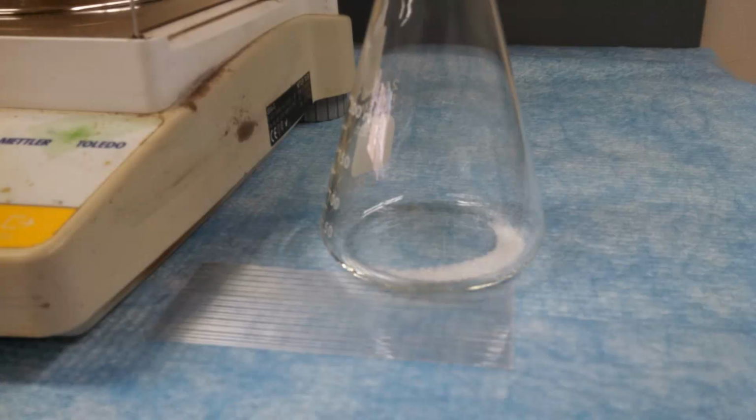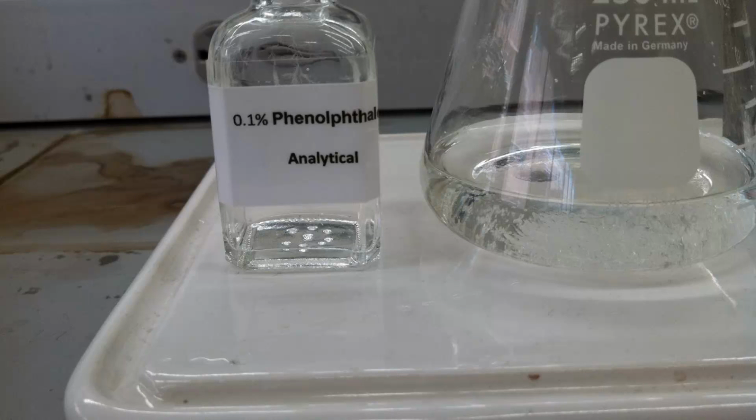Either way. Once you have your KHP in your Erlenmeyer flask, you're going to add about 100 milliliters of water and swirl to dissolve. This takes a long time. Be patient. KHP just doesn't dissolve very quickly, but it will all go into 100 milliliters of water. You're then going to add about 2 or 3 drops of phenolphthalein indicator to the flask and swirl to mix that around. The phenolphthalein is going to be in these little dropper bottles, and they'll be at your bench. So now you're ready to start your titration.